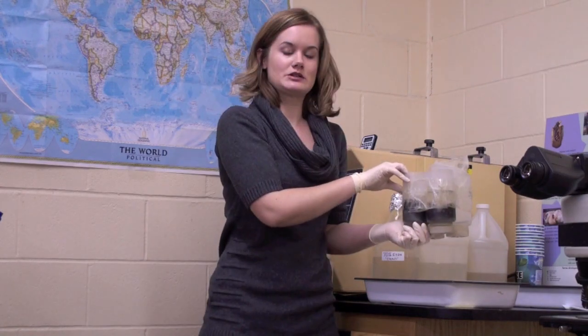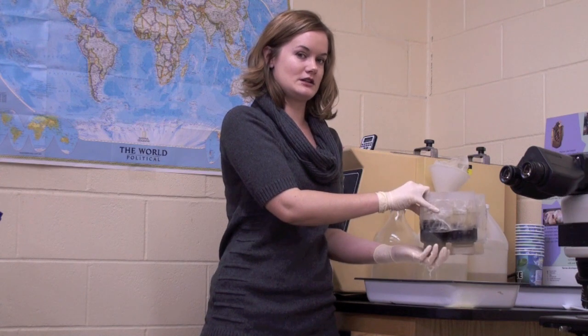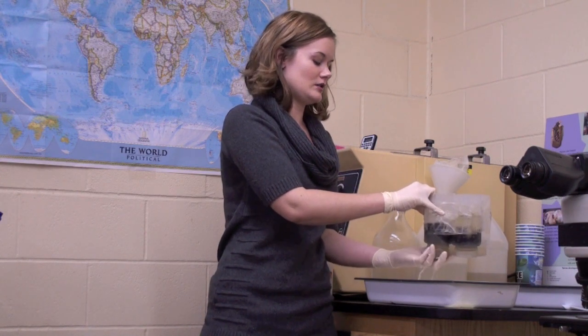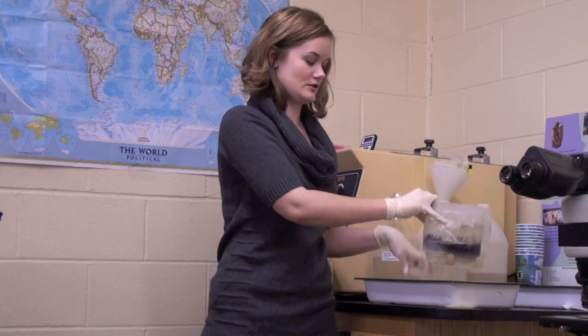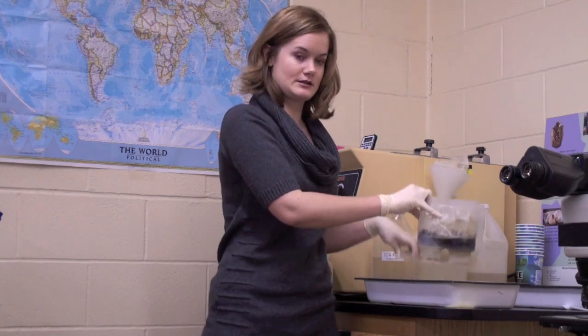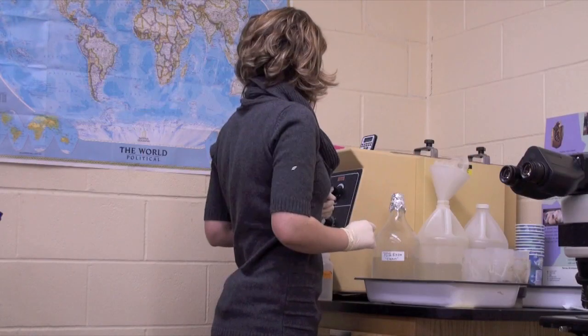Our varroa test has been running for about an hour now so it can be taken out. We can unscrew the bottom of the bottle which has a mesh filter in it to keep the bees in the bottle, and all the alcohol will come out with the varroa mites in the sample. At this point we will collect all the varroa mites and put them in a subsample so we can keep it for further testing if we want to do genetic testing, and we label it and put it in the freezer.